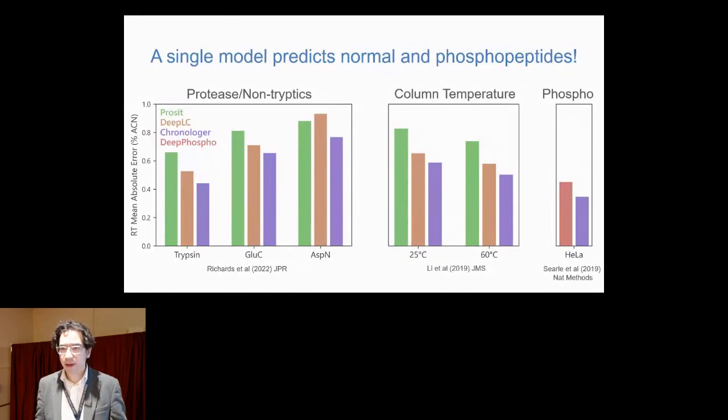There's a retraining system where you can add information in, but rather than retrain the model, we augment the current model. So we add in information to that model so that we can keep the training accuracy of all of the other peptides as well.